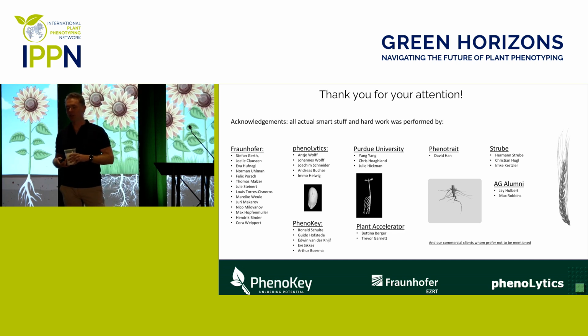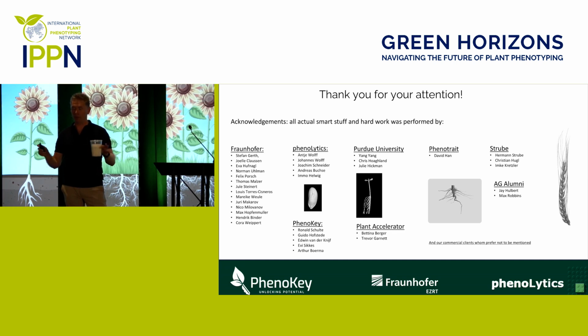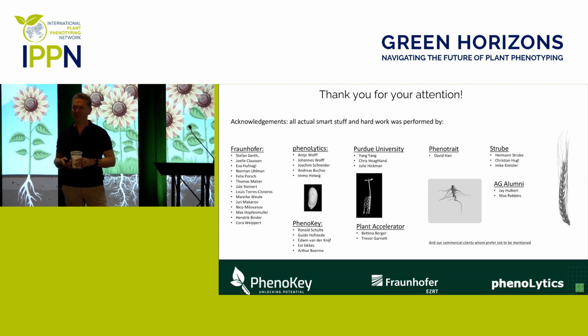Yeah. So in this case, it is a remote operated vehicle. This is a very early prototyping stage, so this is more proof of concept on the method. By using a certified remote, you can be at a safe distance, so that you're not exposed to X-ray radiation. And in the future, that might be and will be implemented in a more intrinsically safe manner, so that you can actually drive something and be close to it.